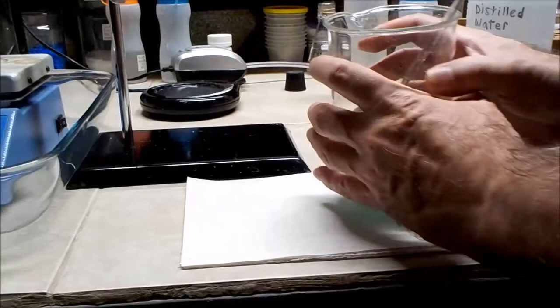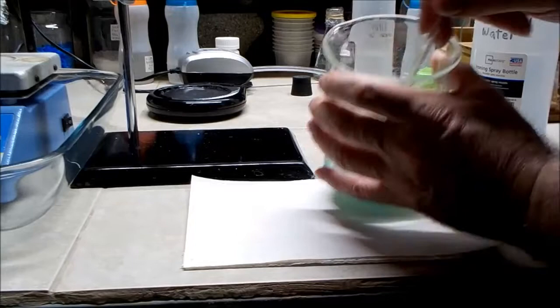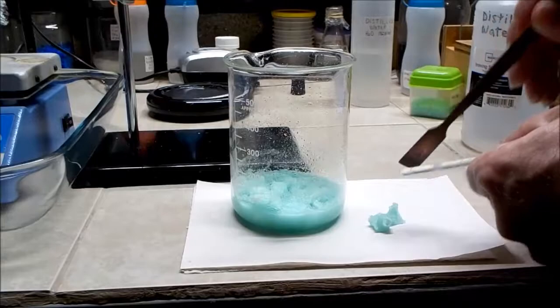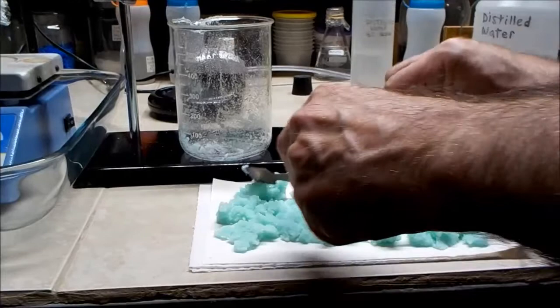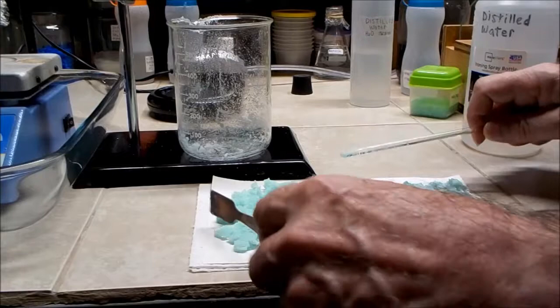So now that everything's cooled down, it's sort of a bunch of wet, small crystals in there. So I'm going to spread this out on this piece of white paper with a paper towel underneath, and hopefully it'll finish drying. So I'll probably let that set at least overnight, maybe occasionally stirring it around, and see how it turns out.